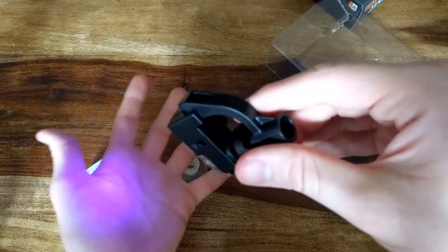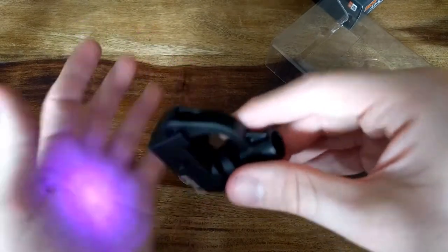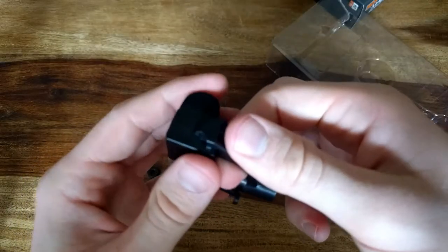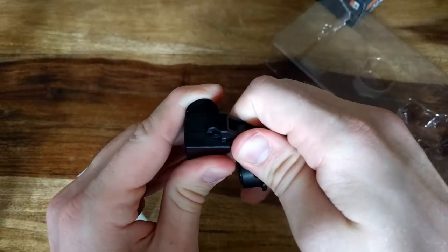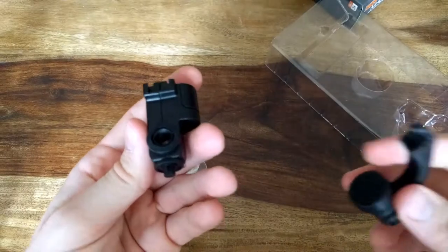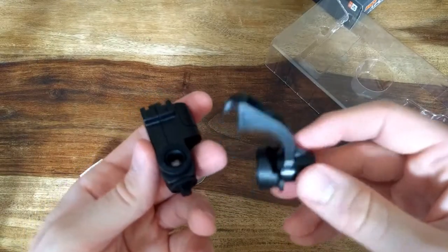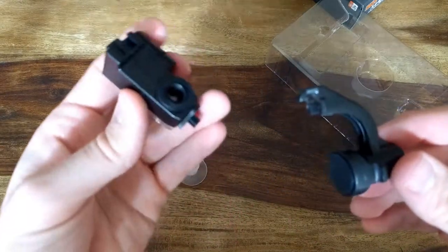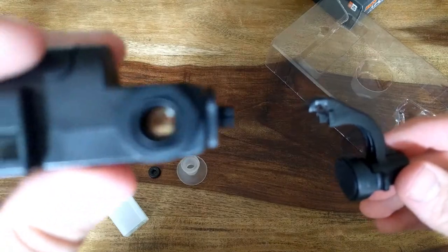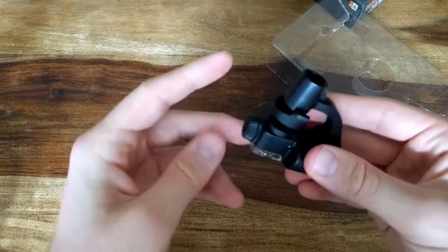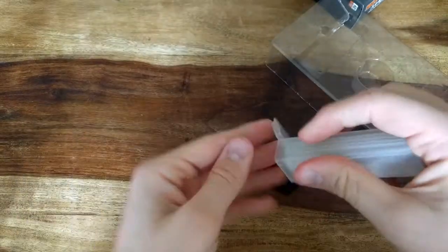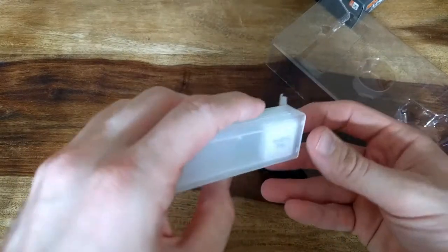You can take this thing off, like this. I didn't break it just now, I just took this thing off and you can look inside. Let me just put it back on. So after you focus, you can screw it and lock the focus. I can see a few samples.